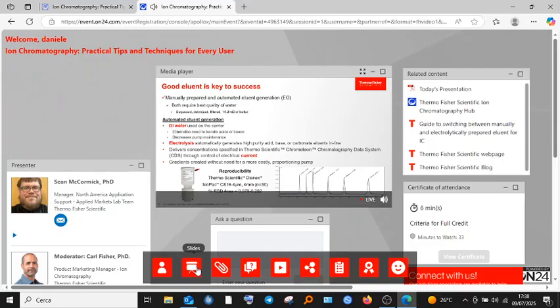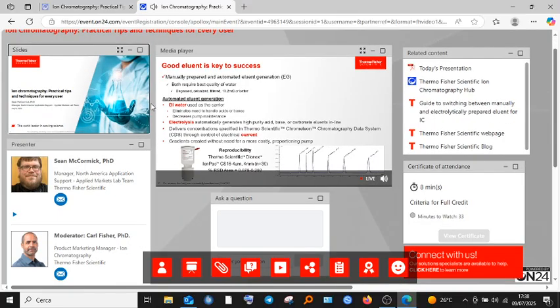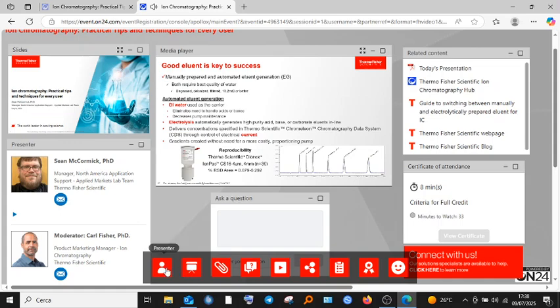This is water that should be degassed, deionized, filtered, and 18.2 megohm or better. The same is true with any salts or liquids you use to prepare your eluents. They should be of the best quality available to get the best results. If you use poor quality water or reagents, you may experience elevated backgrounds and it makes your data harder to analyze.